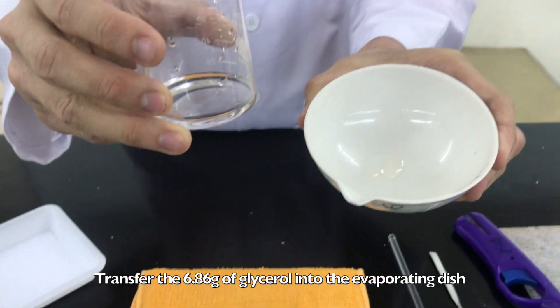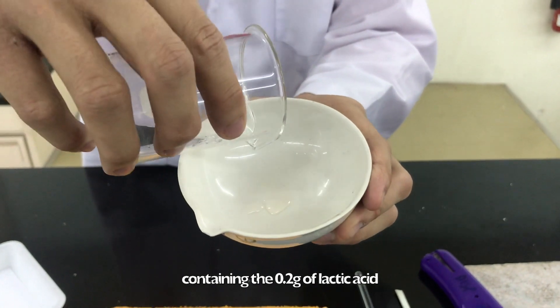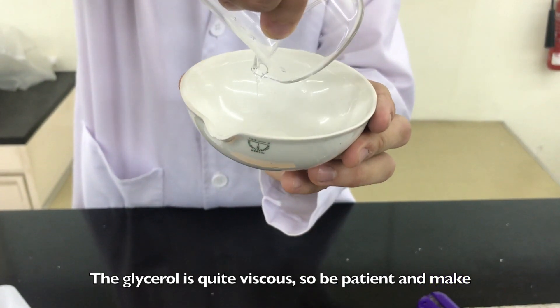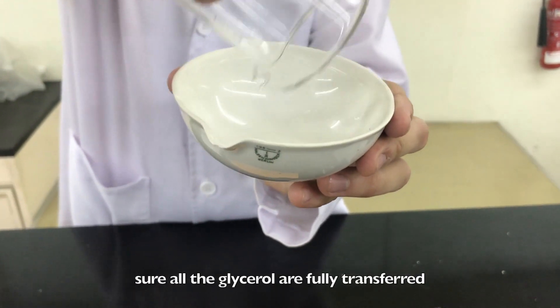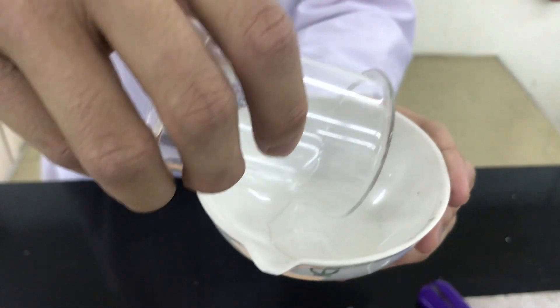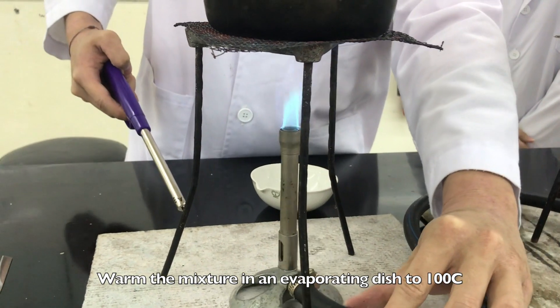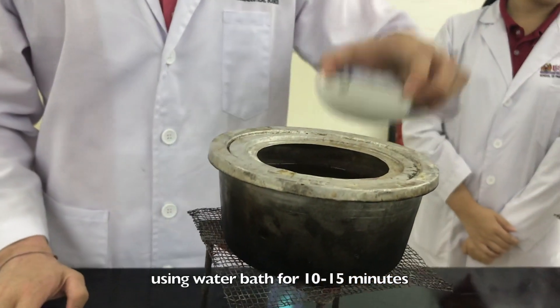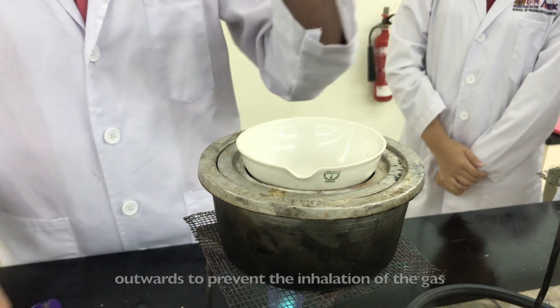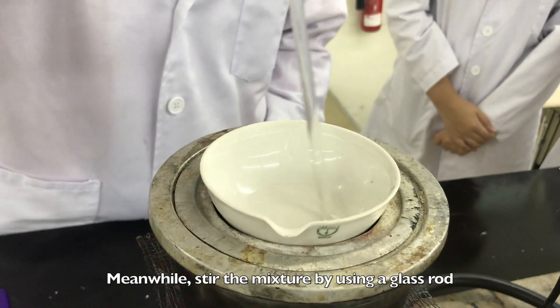Transfer the 6.86 grams of glycerol into the evaporating dish containing the 0.2 grams of lactic acid. The glycerol is quite viscous, so be patient and make sure all the glycerol is fully transferred. Warm the mixture in the evaporating dish to 100 degrees Celsius using a water bath for 10 to 15 minutes. Make sure that the mouth of the evaporating dish is pointed outwards to prevent the inhalation of gas. Meanwhile, stir the mixture by using a glass rod.